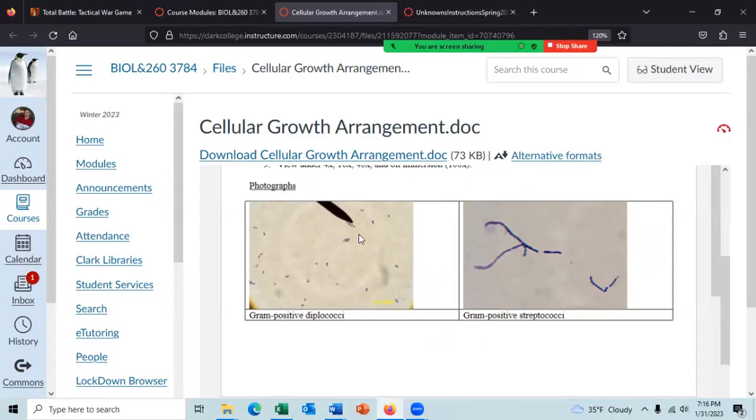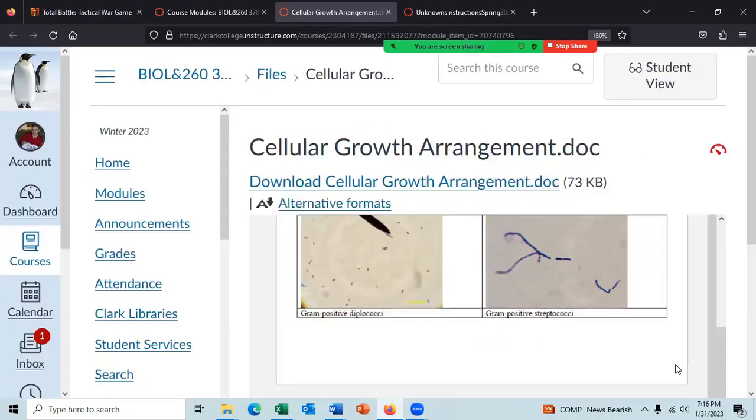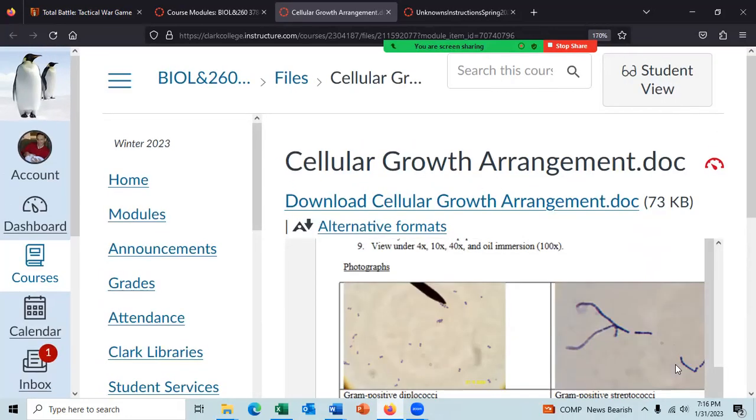So there's that. That doesn't look like a diplococci to me. That looks like a streptococci. There's streptococci. Blow that up. Well, that doesn't look like a diplococci. There's a diplococci right there, and there's another one right there. There's one there too. But where the pointer is, that looks like a streptococci.